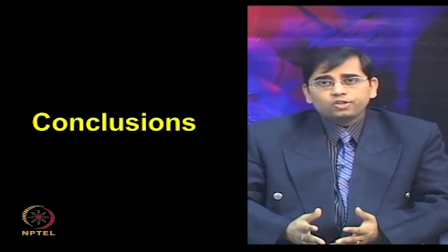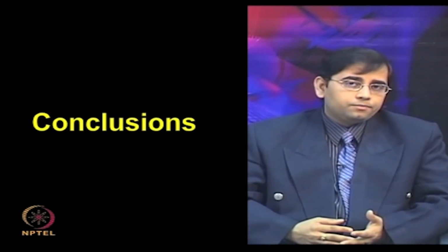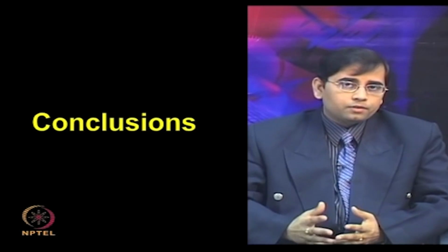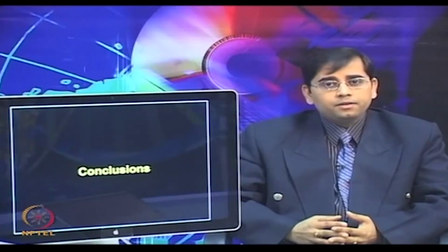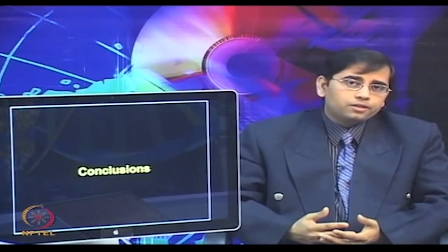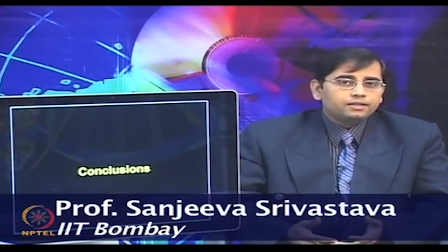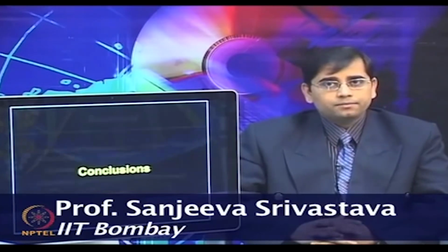Overall, the success of the SPR technique is due to the following factors. First, the kinetic measurement in real time, which is a major strength of data obtained from SPR instruments. Second, monitoring the adsorption of unlabeled analyte molecules to the surface. And third, its ability to monitor weakly bound interactions due to the high surface sensitivity of SPR biosensors.